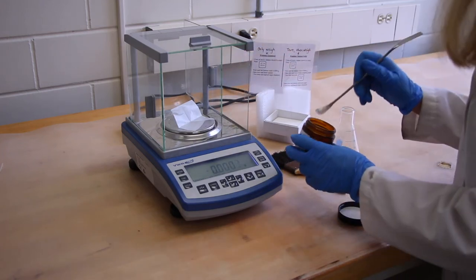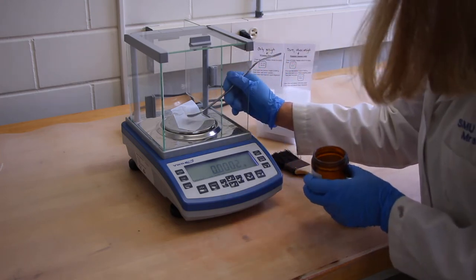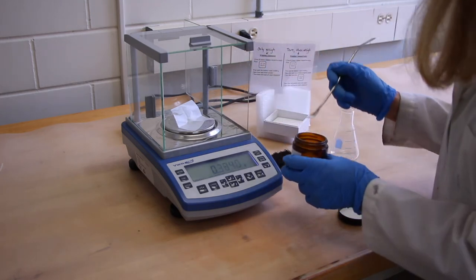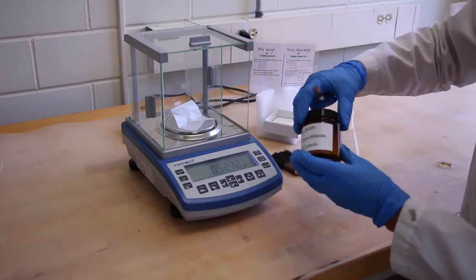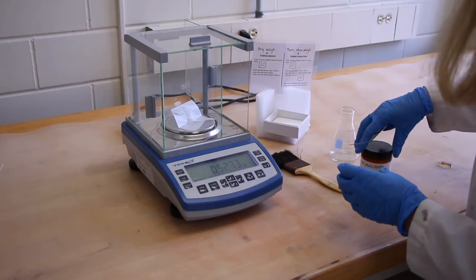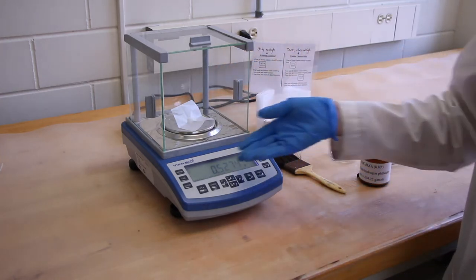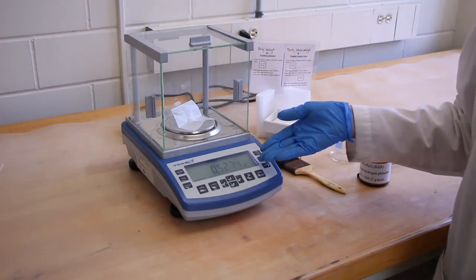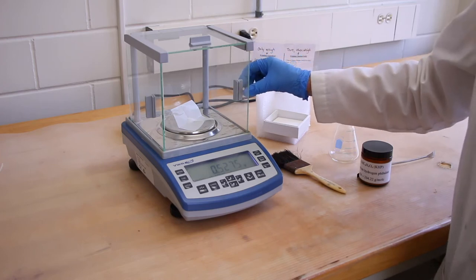I can open up the door and spoon some of the solid that I will be using onto the weigh paper, close the door, and we can read the balance. When you're ready to take it out, it's a very easy thing to do now that we've folded our weigh paper.